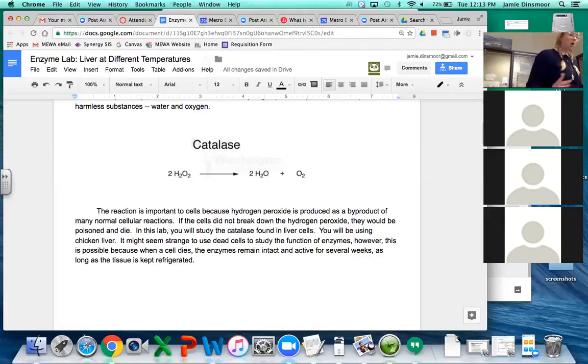All right. So what we're going to do is we need a brave volunteer who wants to touch the chicken livers, and wants to cut them into little pieces for us.